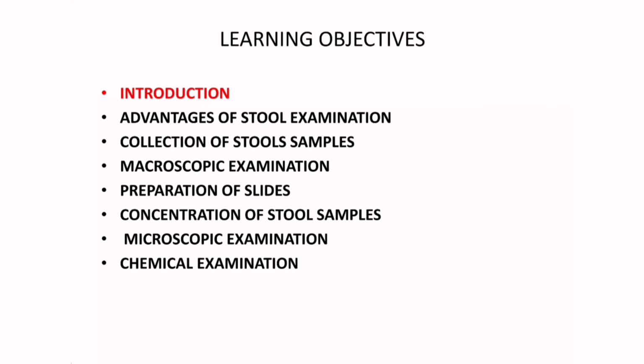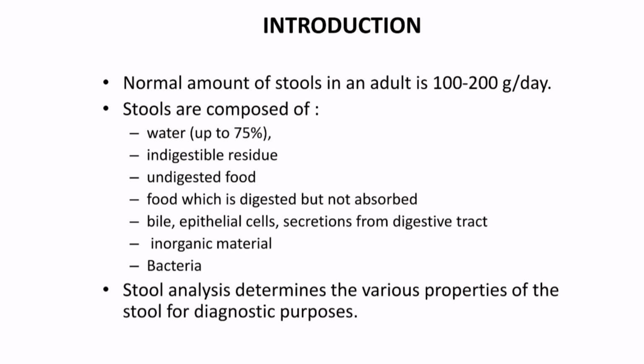Learning objectives. First, we have the introduction, then we have the advantages of stool examination, collection of stool samples, macroscopic examination, the preparation of slides, concentration of stool samples, microscopic examination, and chemical examination of stool.